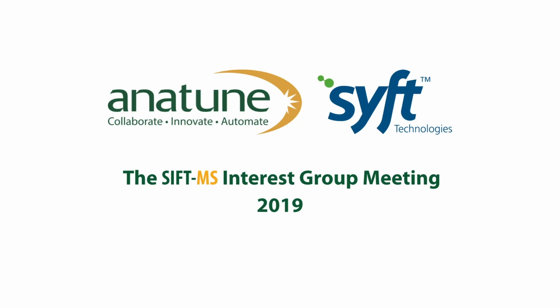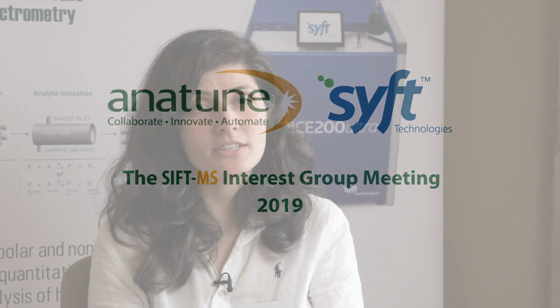I'm Georgia and I'm a chemical engineer, and I work as a PhD student at the University of Strathclyde, specifically at CMAC. CMAC tries to jump from batch to continuous manufacturing. The title of my talk is Determination of the Supercritical CO2 extraction drying endpoint using SIFT-MS analysis.